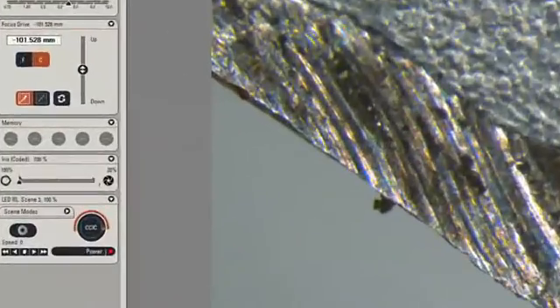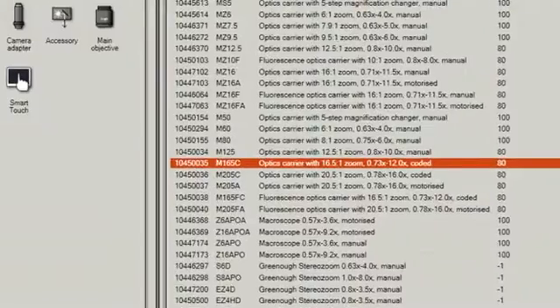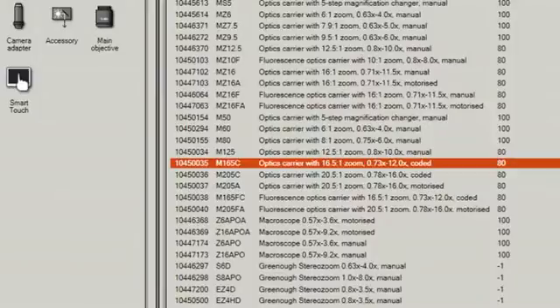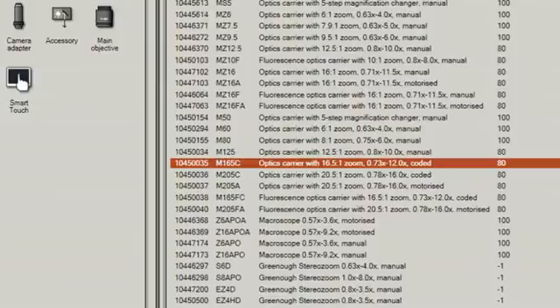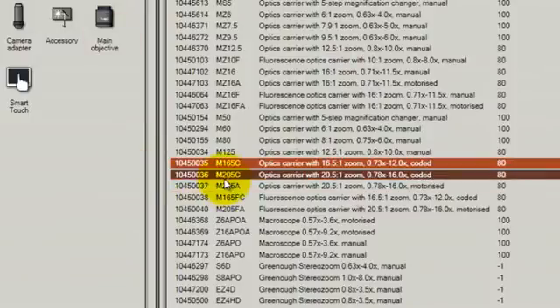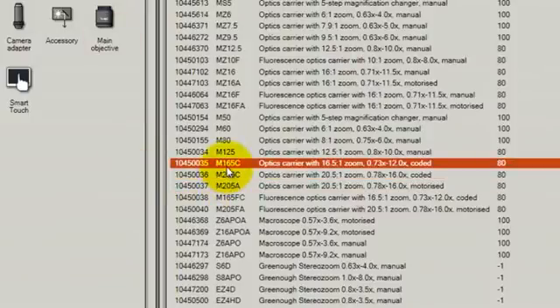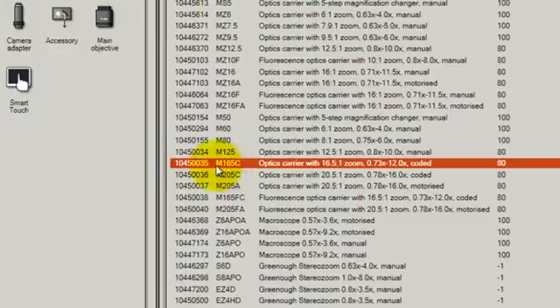If we start with the setup, the setup is important because this allows us to ensure that the microscope configuration is correctly entered into the software. In this case, the type of microscope has been detected automatically as an M165C.